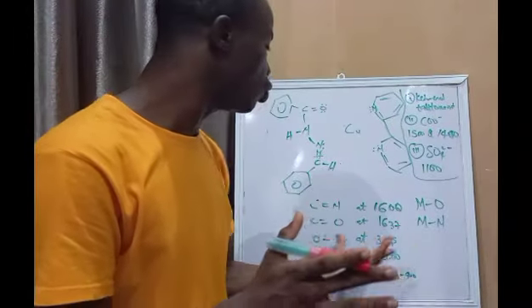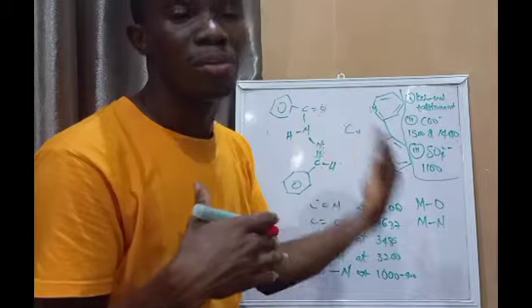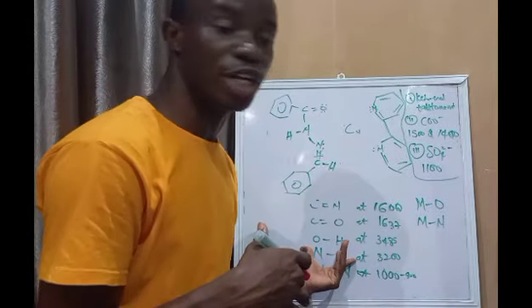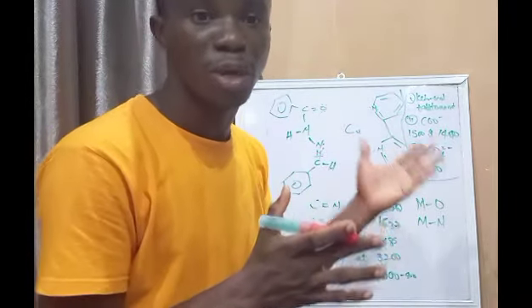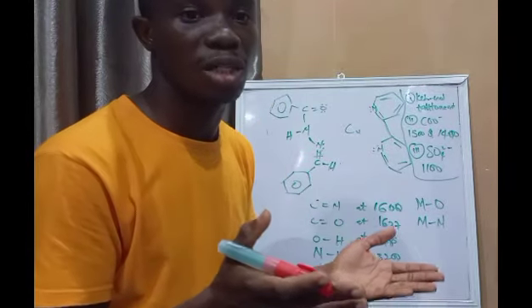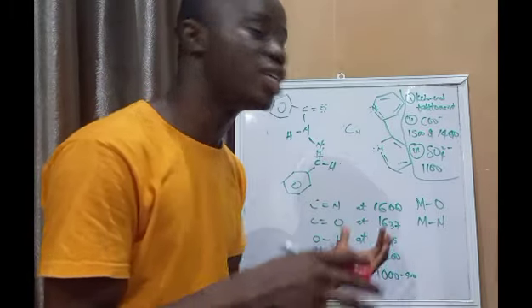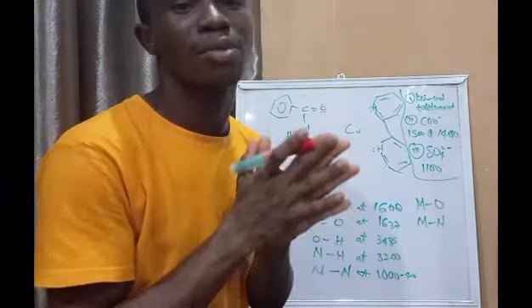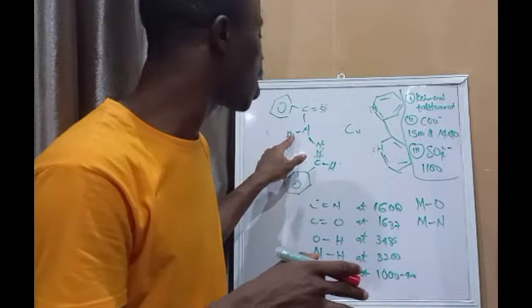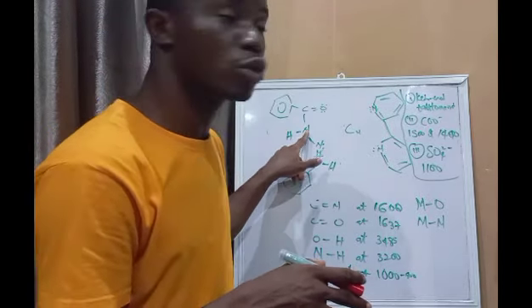So when you compare, if you look out for this NH signal, for example, before the reaction, you have an NH signal in the spectrum for the ligand. And after the reaction has taken place and you are looking at your complex and you see that this NH signal is no longer there, that might imply that something has happened to this H that is attached to this N.